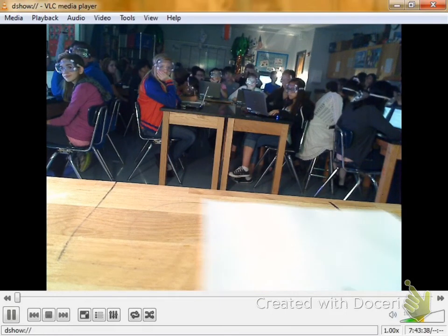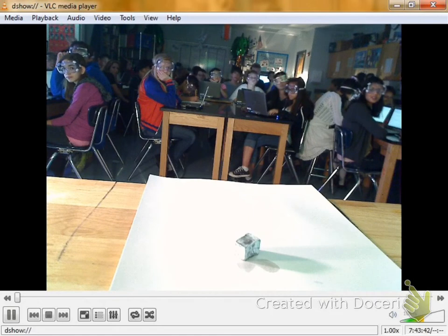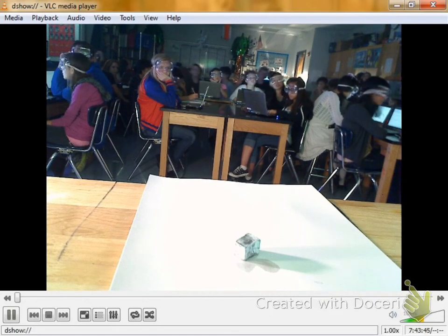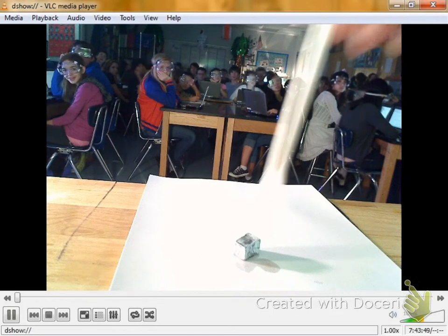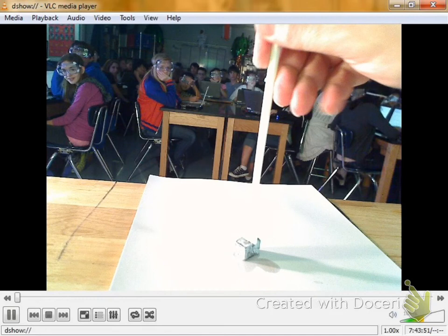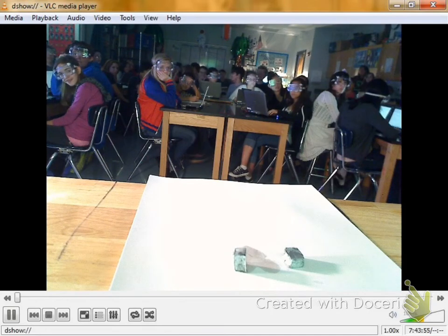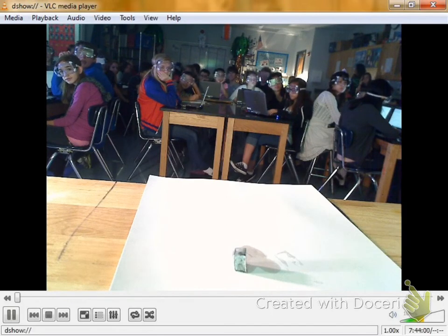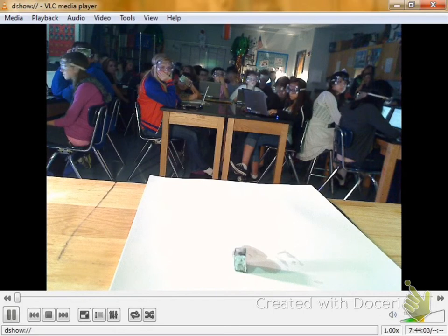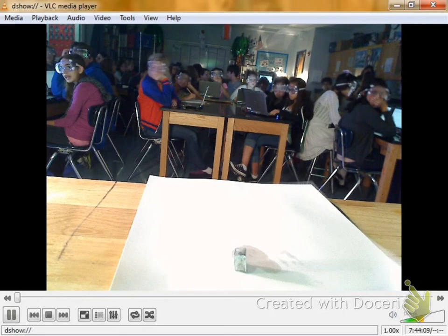What do you think's going to happen with the potassium? Easy to cut? Hard to cut? Should be as easy as cutting melted cheese. This is like melted butter. Yeah. Mission accomplished.